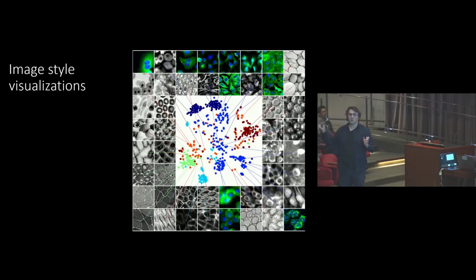So we thought we'd throw a few images in there that were of the same kind of problem that we wanted to see if the algorithm would generalize to them, because we thought really what we want this generalist algorithm to do is recognize that an image is made out of many different objects, but all of the objects are very similar to each other. So that's really the underlying problem we're trying to solve.